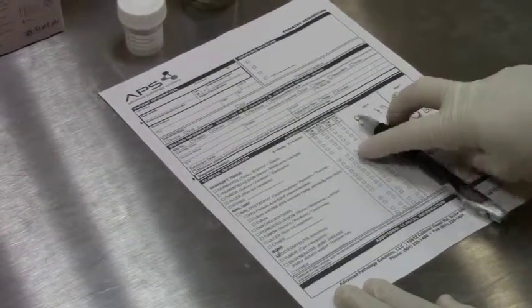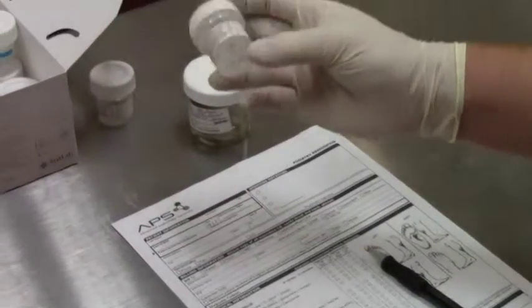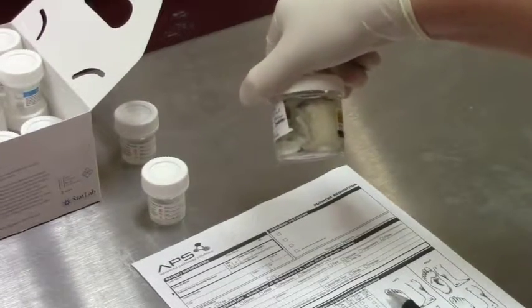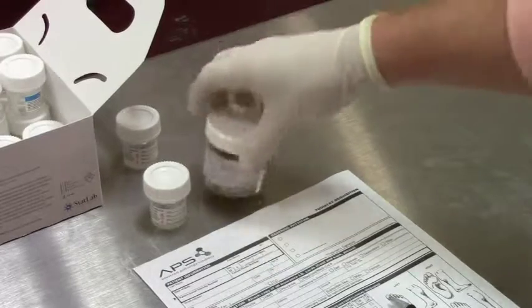And just make sure that if you have a smaller specimen that will fit in here and cover itself in formalin, you can use a 20 mils. But if you have a bigger specimen, like this for example, it needs more formalin. Just make sure that you don't leave any tissue out of formalin. You'll need a bigger bottle.